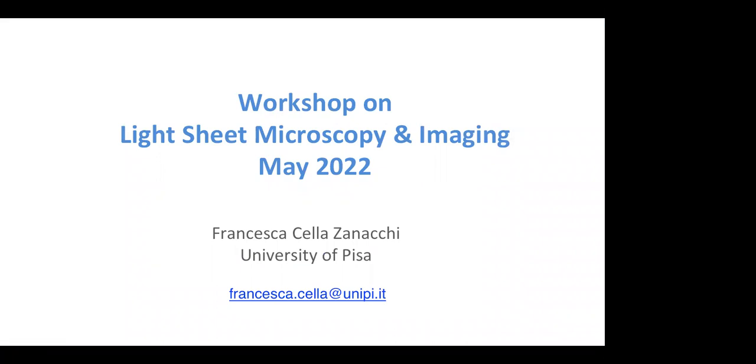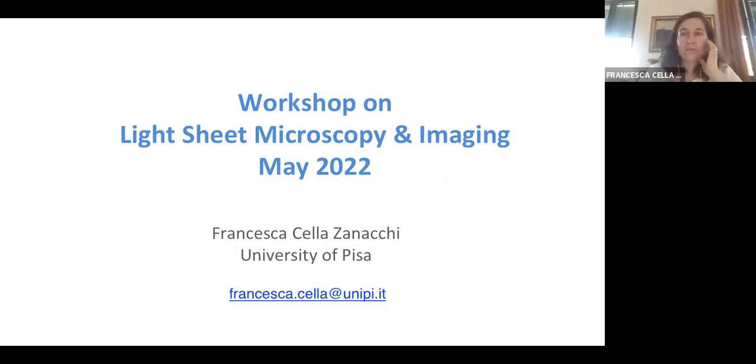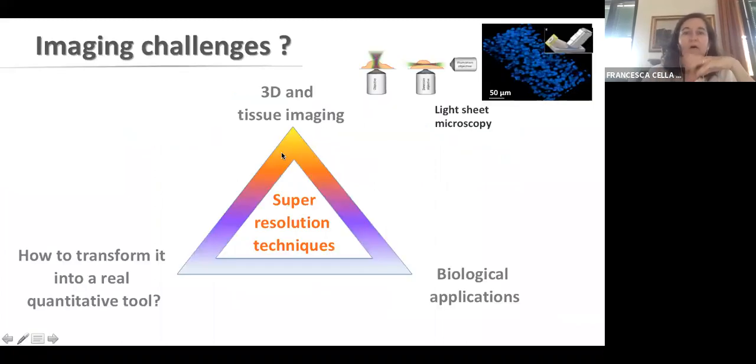So thank you very much for the nice introduction, and I'm really happy to have this talk at this nice workshop. And I will try to focus basically on, as Professor Mondal mentioned, super resolution techniques. But I will try to look at it from the other side. I'm not focusing on super resolution itself. I'm focusing on how the marriage between light sheet microscopy and super resolution can gain advantages in bioimaging.